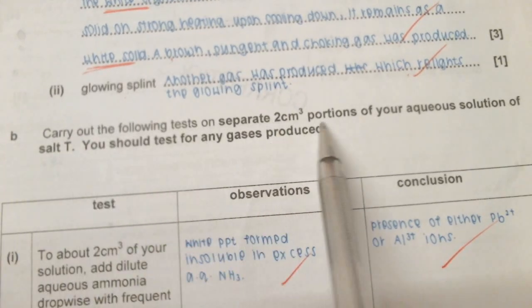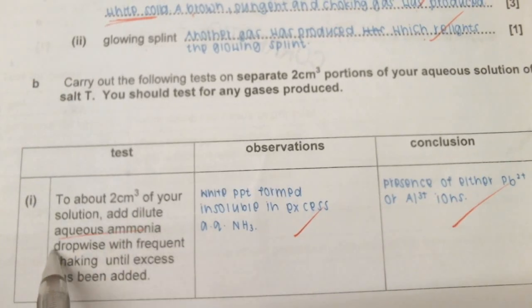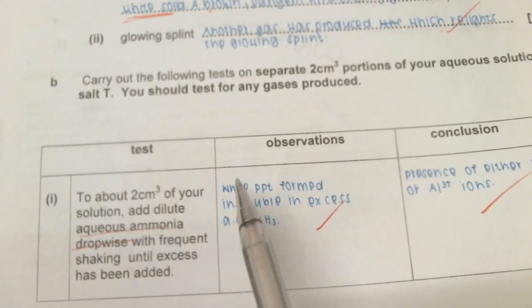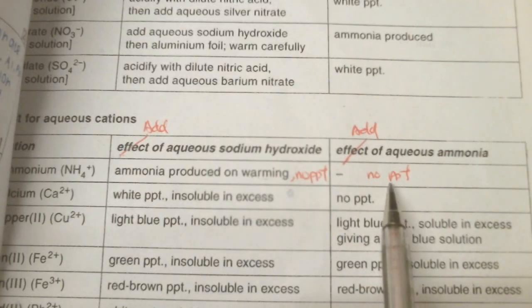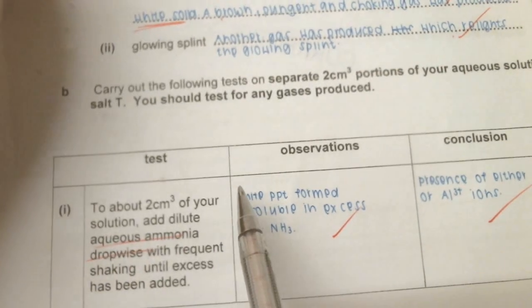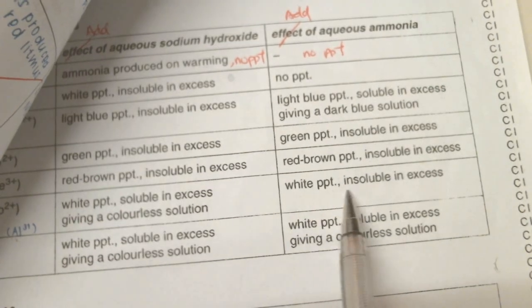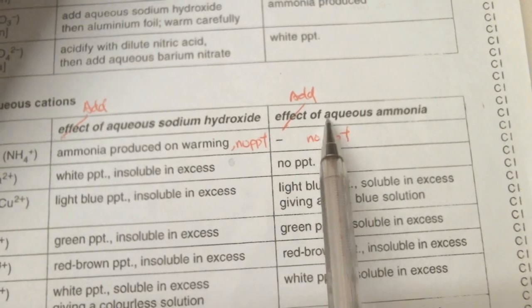B. Carry out the following test on separate portions of the aqueous solution of T. And here is the familiar reagent that you are using, aqueous ammonia, added to 2 cm³ of the solution sample. So we should look at this table here. So what do you see? You saw a white PPT formed, insoluble in excess aqueous ammonia. I should have written down this. From here, we can roughly strike out calcium, because for calcium, you would have no PPT formed.